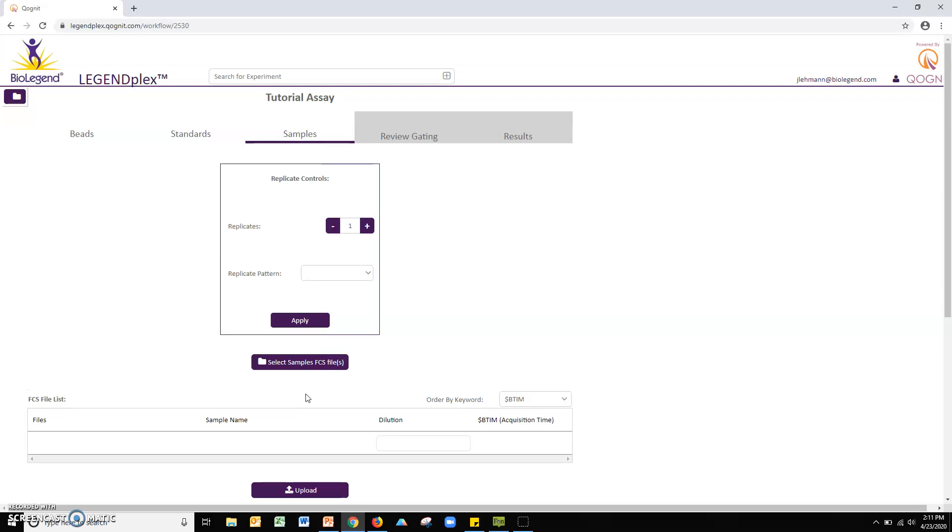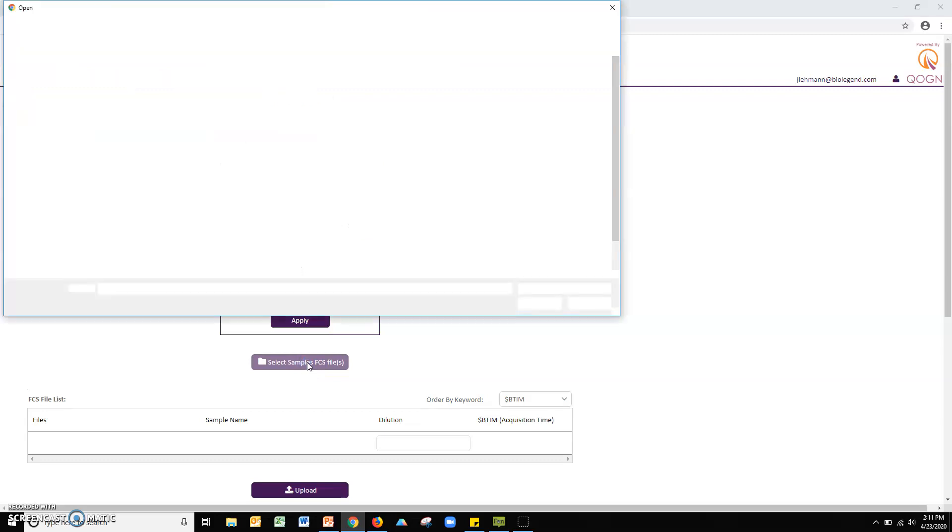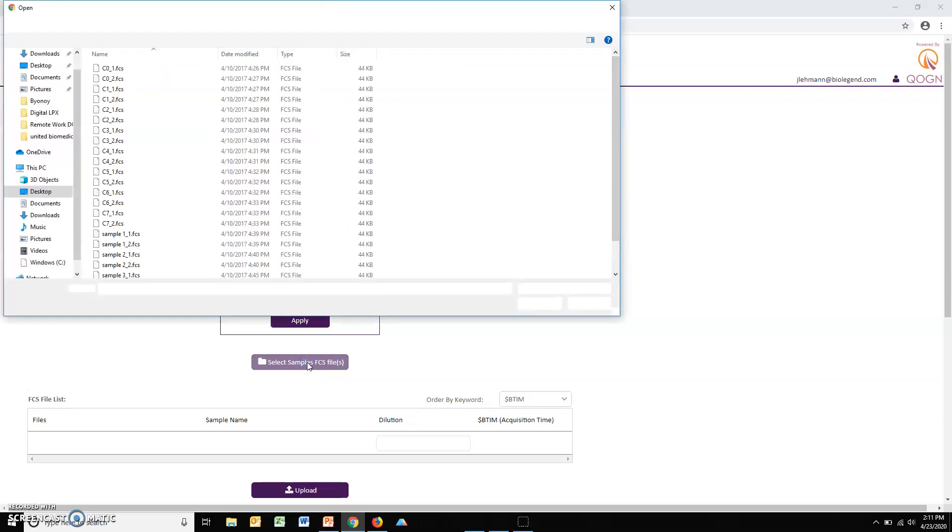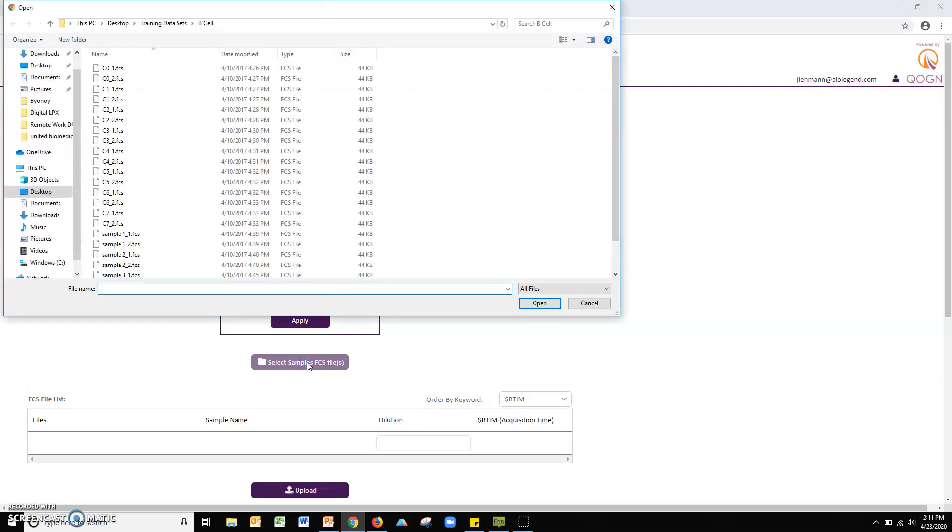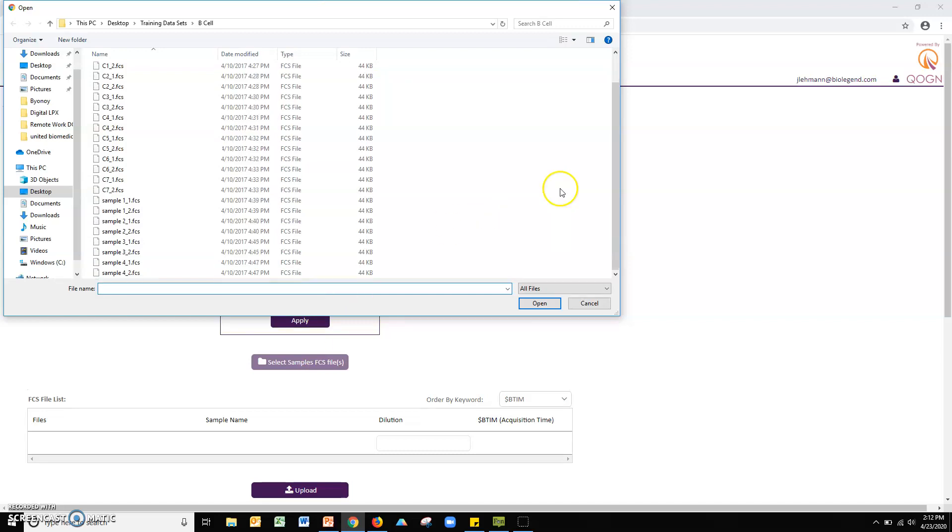Next, we will upload any experimental samples. Click the select samples FCS files button. Navigate to the appropriate folder on your computer and then select all sample files from your assay and click open.